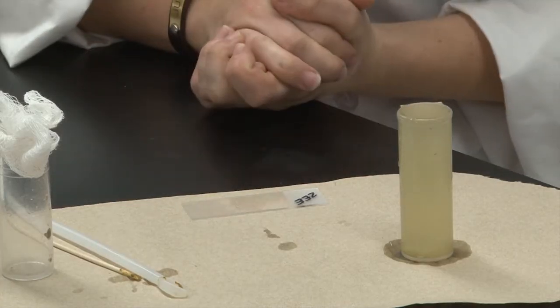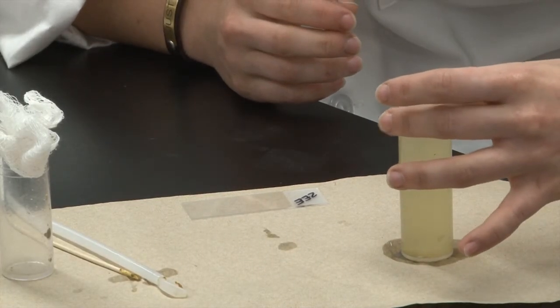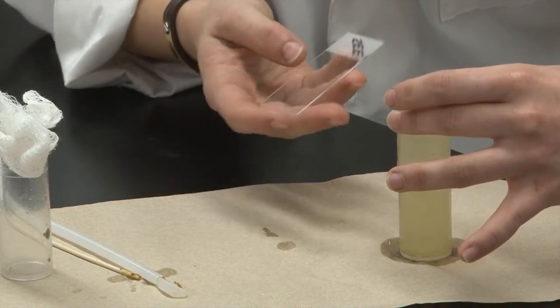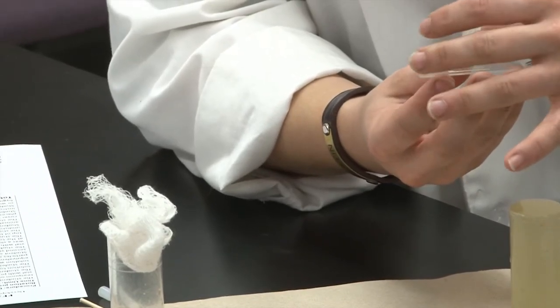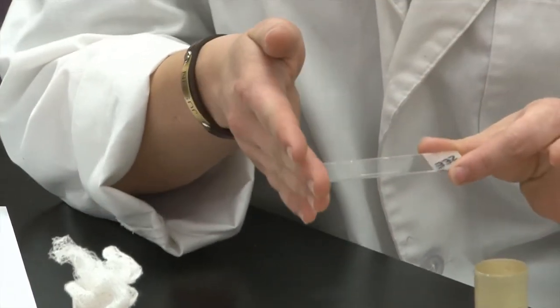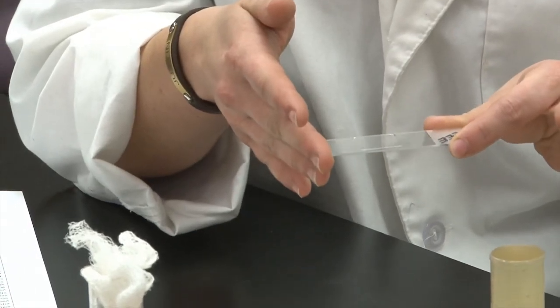Once it's been 10 minutes, we can take our cover slip off of the top, holding it by the corners, and place it onto our glass slide. Once you have it on the slide, you want to make sure to keep it very level and not to tip it, or you'll lose your sample.